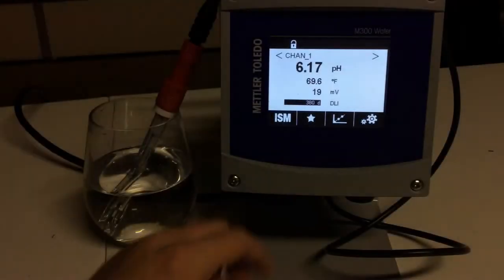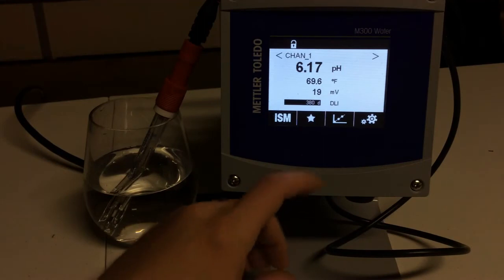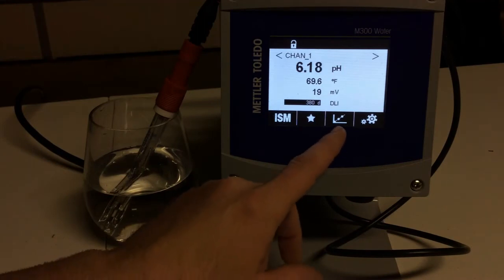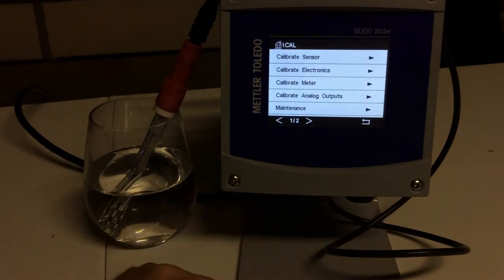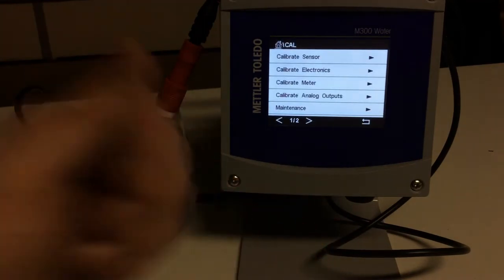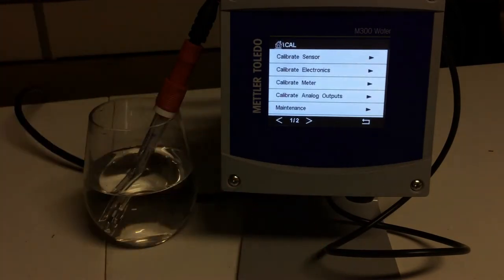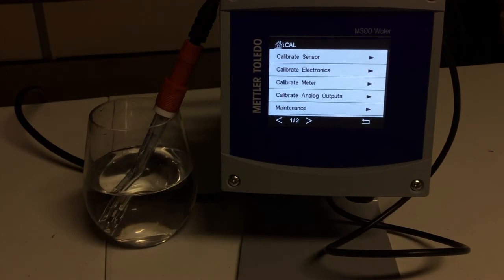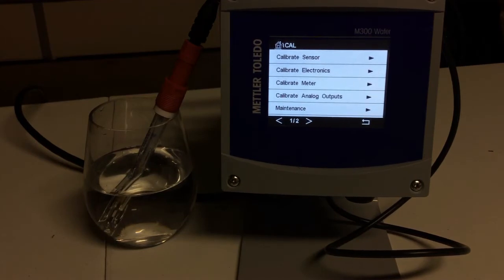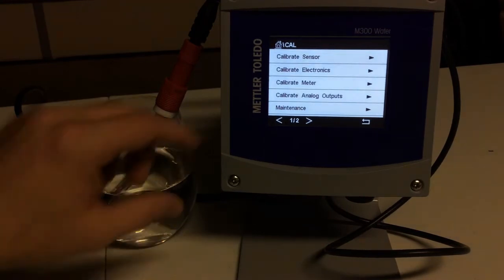You can do your calibrations of your sensors right in the field if you'd like on your transmitter, and this is how you would do that. So the next button we want to look at is our calibration, and so here's where we can calibrate our sensor, the electronics, the meter, do our maintenance, our cleaning of the sensor right through the transmitter itself.